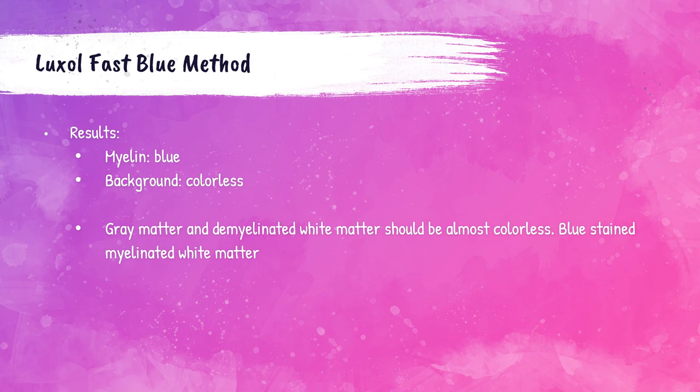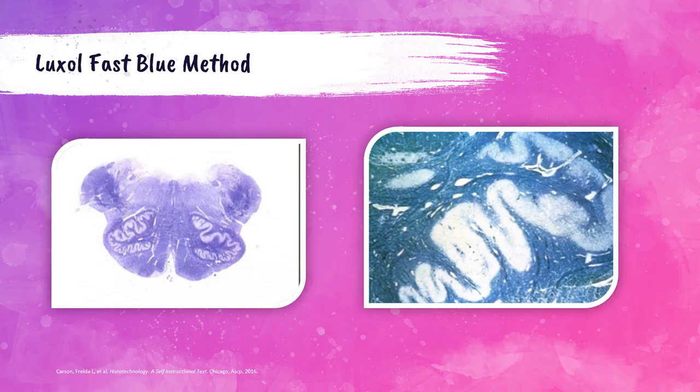When stained with Luxol Fast Blue, myelin will be blue and the background colorless. Myelin should contrast sharply with the colorless gray matter and demyelinated white matter. Photos show a medulla cross-section with sharp gray/white matter differentiation (white = gray matter, blue = white matter/myelin) and an olivary nucleus section where the colorless area is gray matter and the blue color is the white matter/myelin.